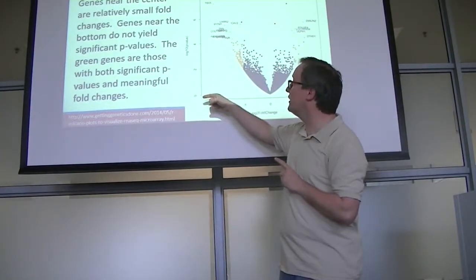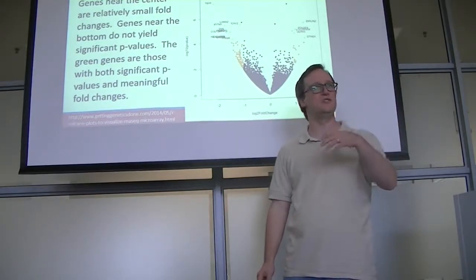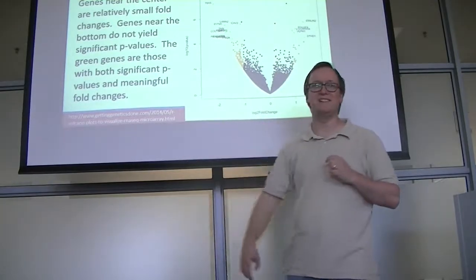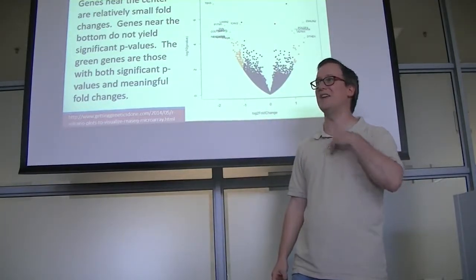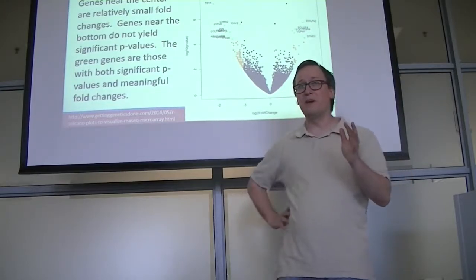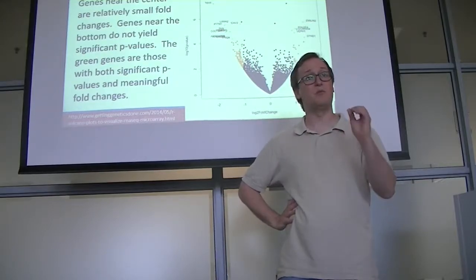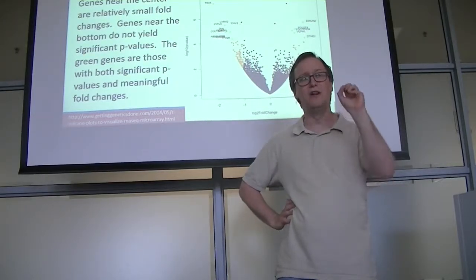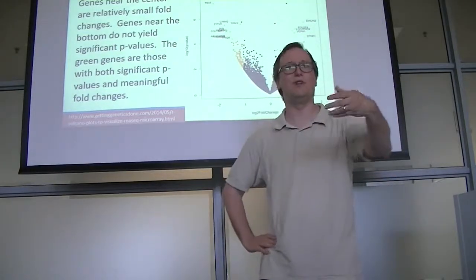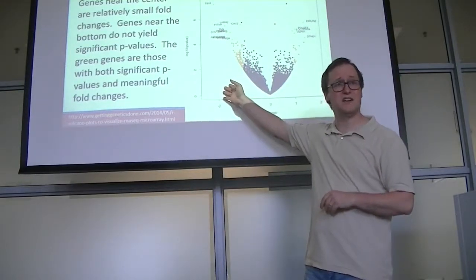Now, on the Volcano Plot, we use the p-values, but not just as they're produced. We're using negative log base 10 of the p-value. If you remember my talking about Phred scores a while back, we expressed the probability of error for an individual nucleotide by taking its negative log and multiplying by 10. The same can be done in this context.